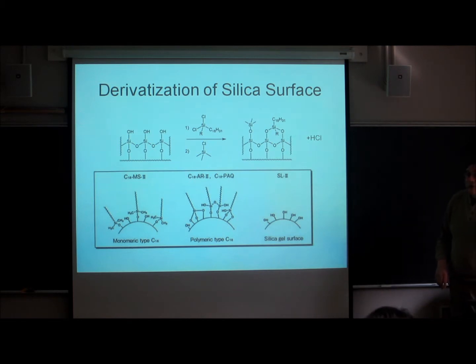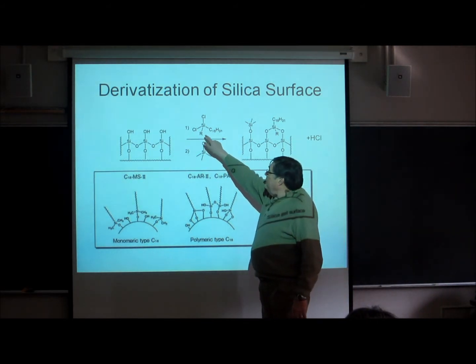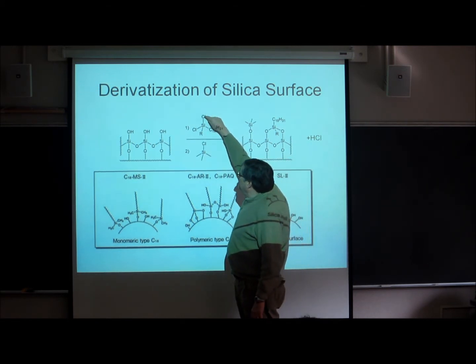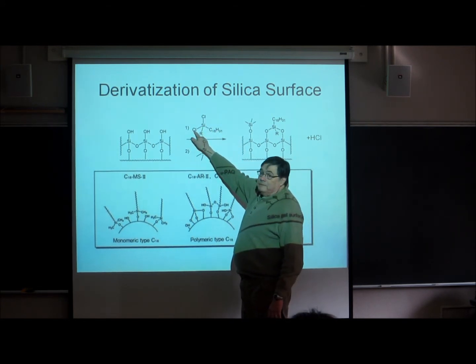What we're doing is a condensation reaction on the surface of the particle. We're taking a chlorinated silane, and this is just a general one, but this is probably the most popular one. The most popular agent, though, has another R group up here. Usually these are 2 methyls, and this is a C18 group, and then a chloride.